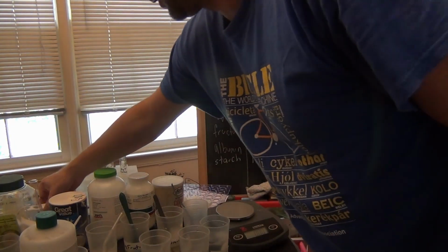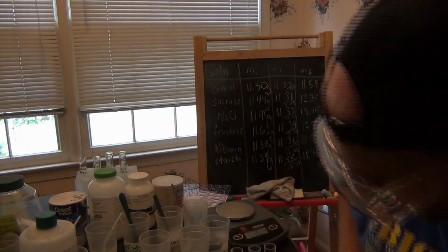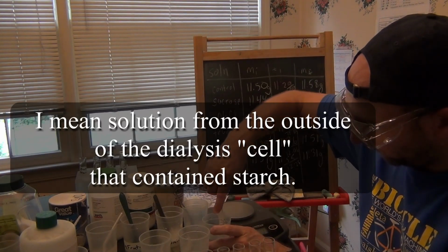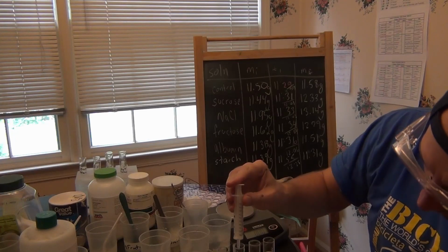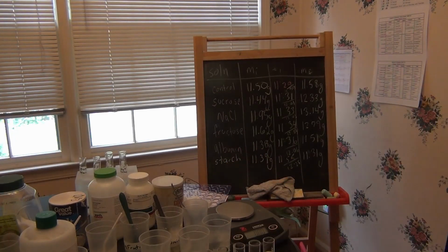Okay, and I'm going to grab some starch from the outside. I'm also going to grab some sucrose from the outside.